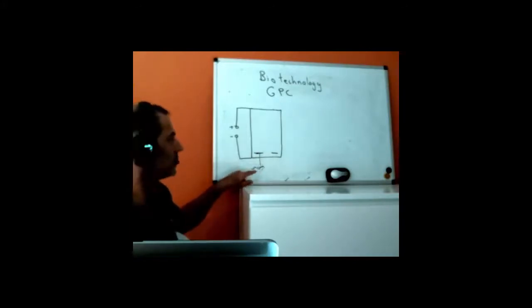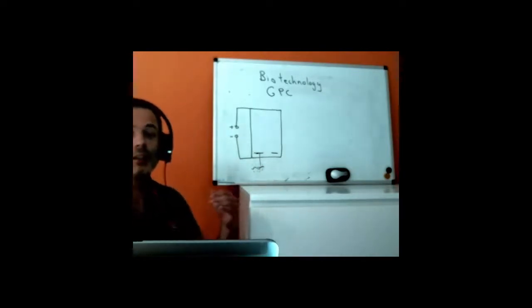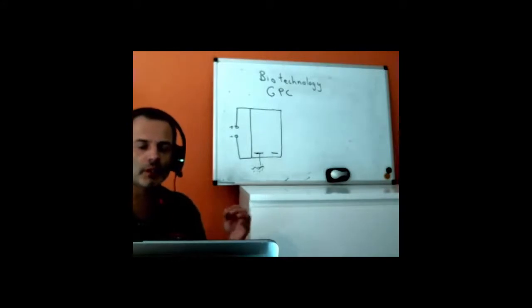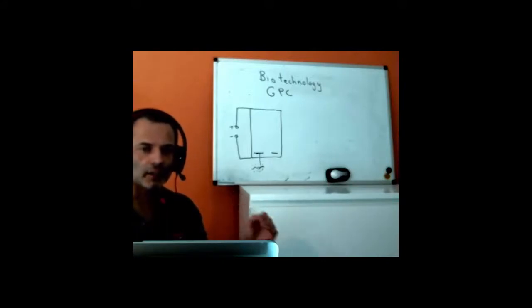Therefore, we need a method for cutting the DNA into sections so that we know what they are. Because if we take a whole chromosome, it's so big that the differences between people is very minor and we won't see it in this measurement. Luckily, we've mentioned this already, there are chemicals, there are enzymes inside the cell body that are specially there to attack DNA and cut it into pieces. A great many of these cut the DNA only at certain sequences, and that's really useful because that means that if we mix them together we can cut DNA at the same place for the same person. So if we take a bunch of DNA, it will all be cut to the same lengths, and we will have a mix of lengths and be able to separate them.